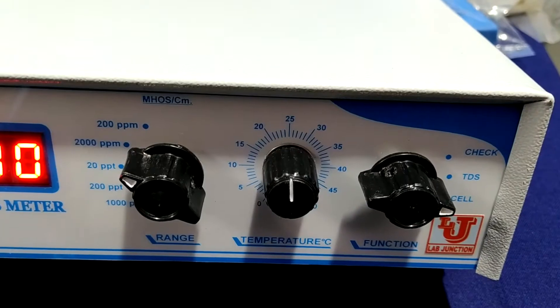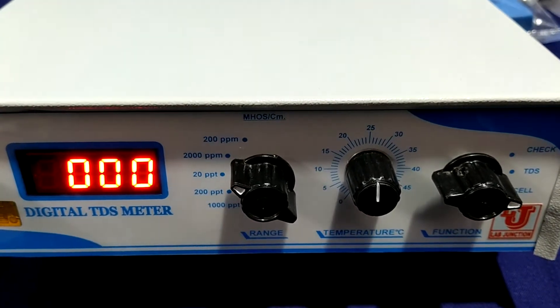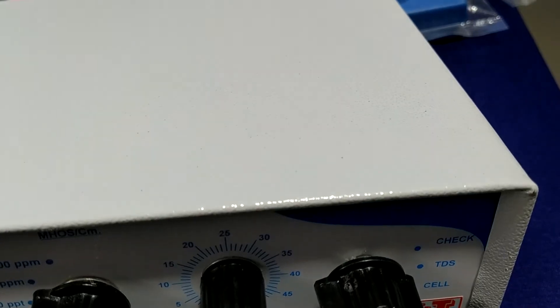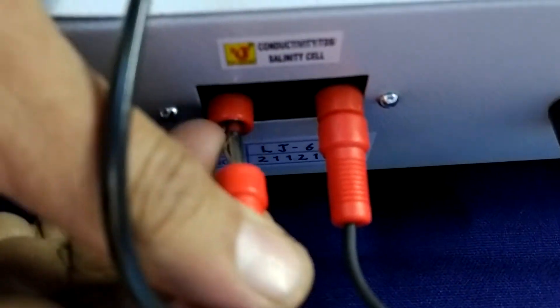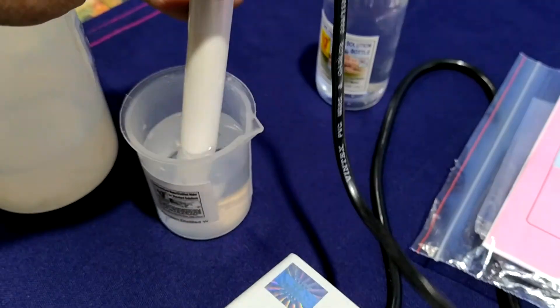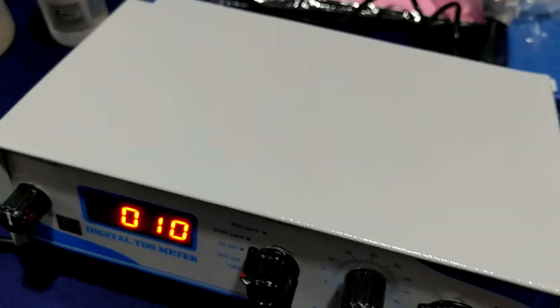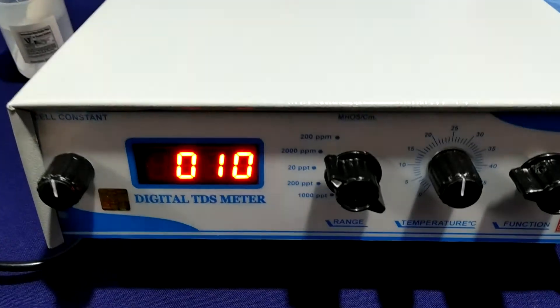Now, how to standardize this digital TDS meter and how to use it. I am connecting the TDS cell to this TDS meter. Just plug it in and dip it in distilled water before half an hour of the testing schedule.